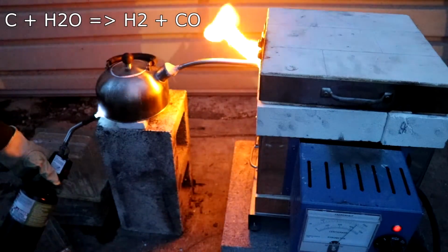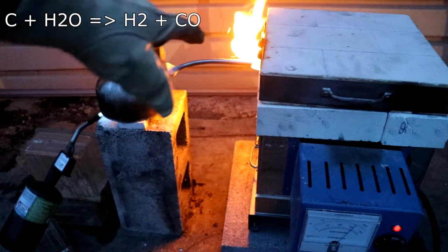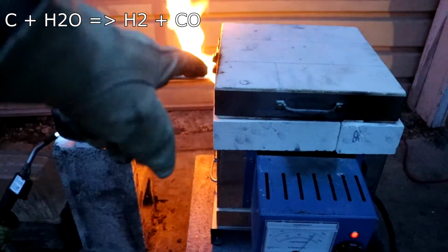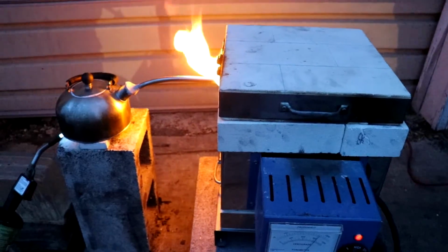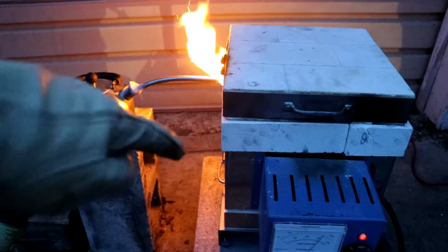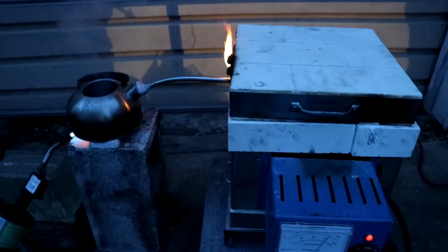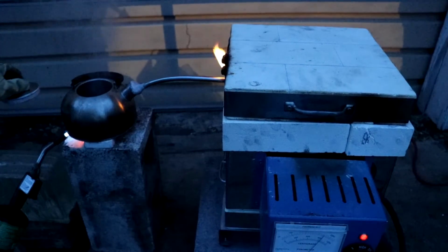Look at that. That's carbon monoxide and hydrogen burning from the steam reacting with the charcoal and producing water gas. Nice, that means it's working. If I remove the steam source, it stops immediately.